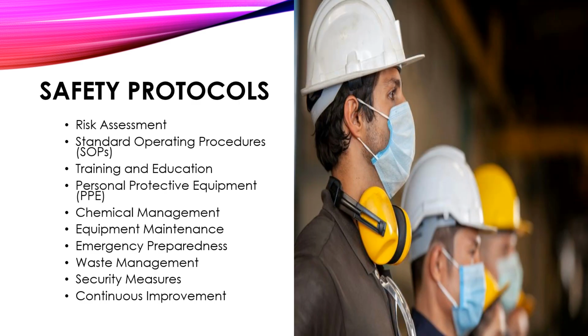Safety protocols. Safety protocols in laboratory management systems are crucial for ensuring the well-being of laboratory personnel, maintaining compliance with regulatory standards, and safeguarding the environment. The following are some key safety protocols commonly implemented within laboratory management systems. The first is risk assessment.